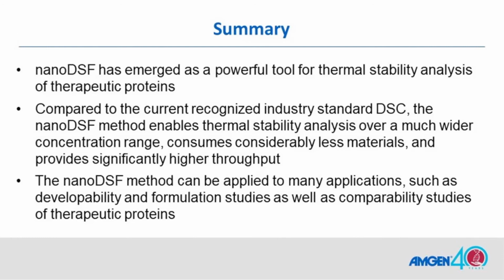The nanoDSF method can be applied to many applications, such as developability and formulation studies, as well as comparability studies of therapeutic proteins.